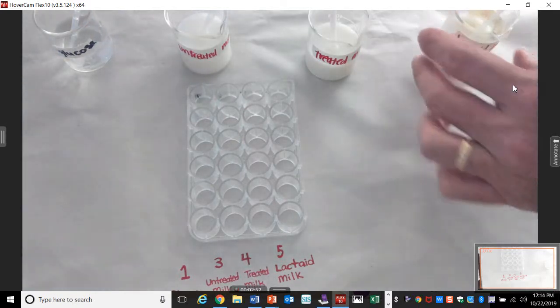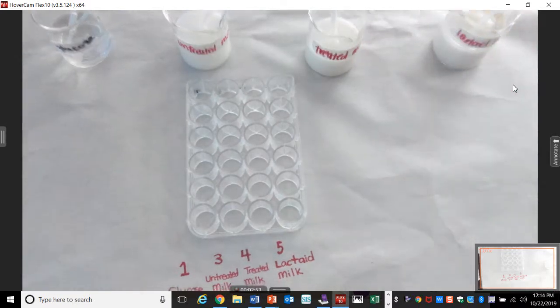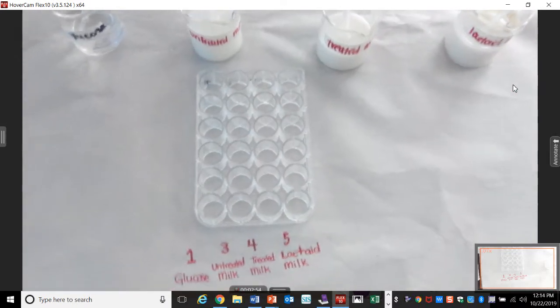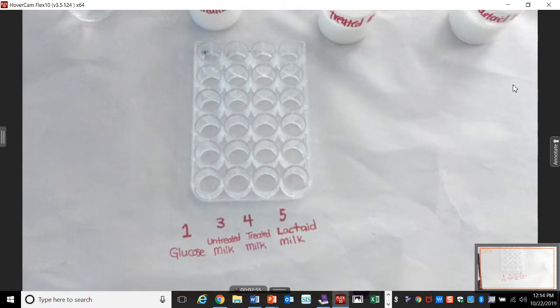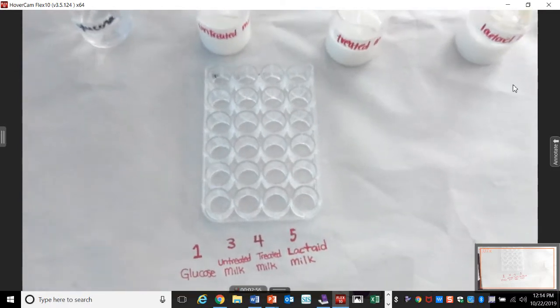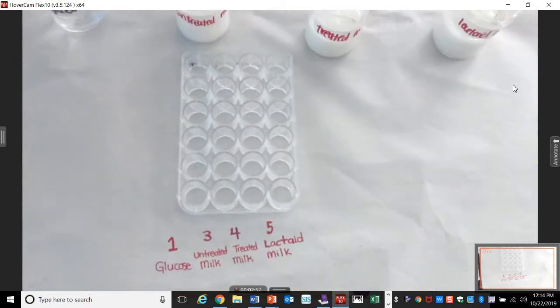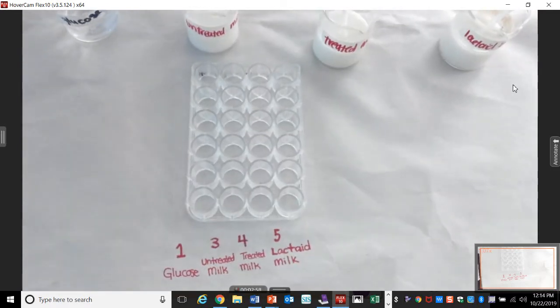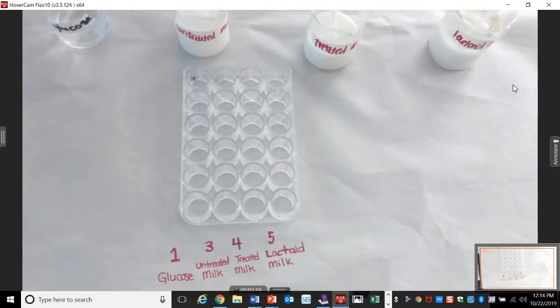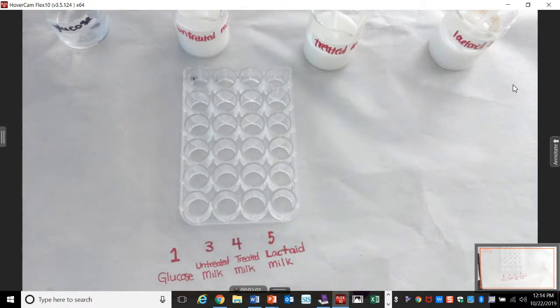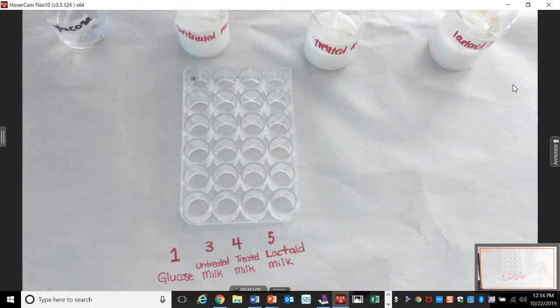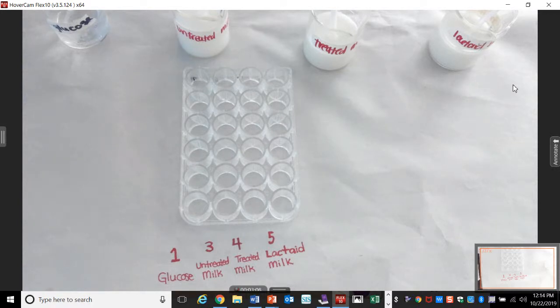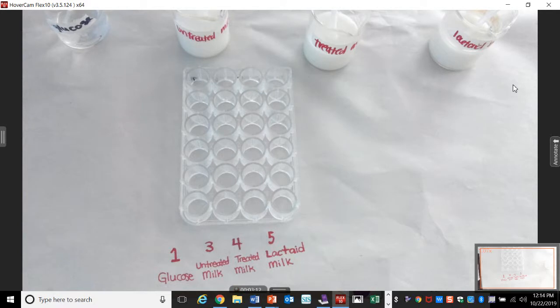How much do you need in each well? Three drops. Yeah, two, three drops. Enough to cover the bottom. That's all you need. And then bring it back. And make sure you put it on the appropriate stand back there. It's all labeled. So make sure it all gets back to where you got it. Should be pretty straightforward. It's pretty easy to do.